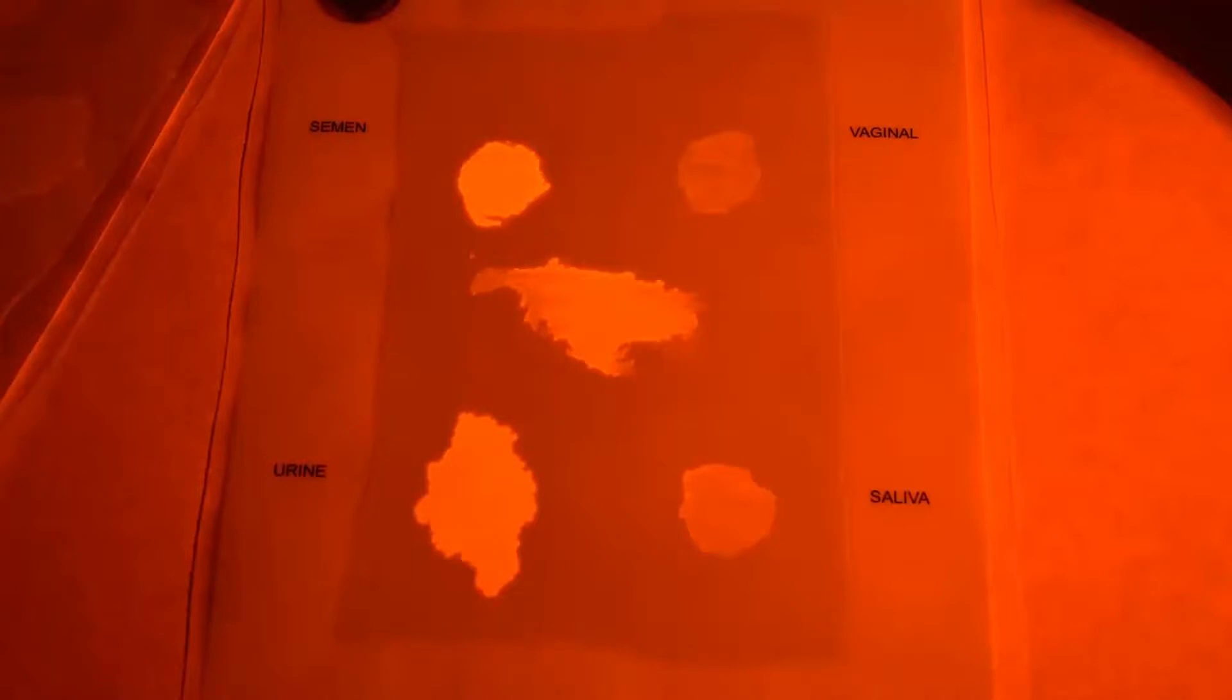A forensic light source is an effective tool to find body fluids such as semen, urine, saliva, and blood. All body fluids fluoresce, except for blood, which absorbs light and becomes darker.